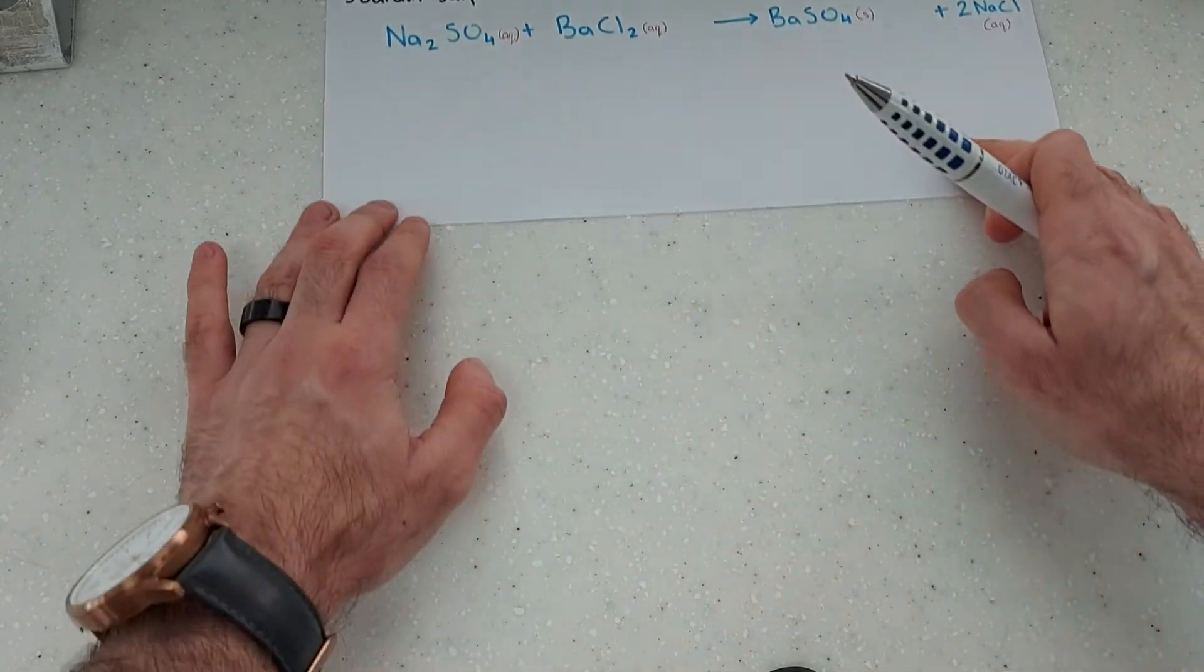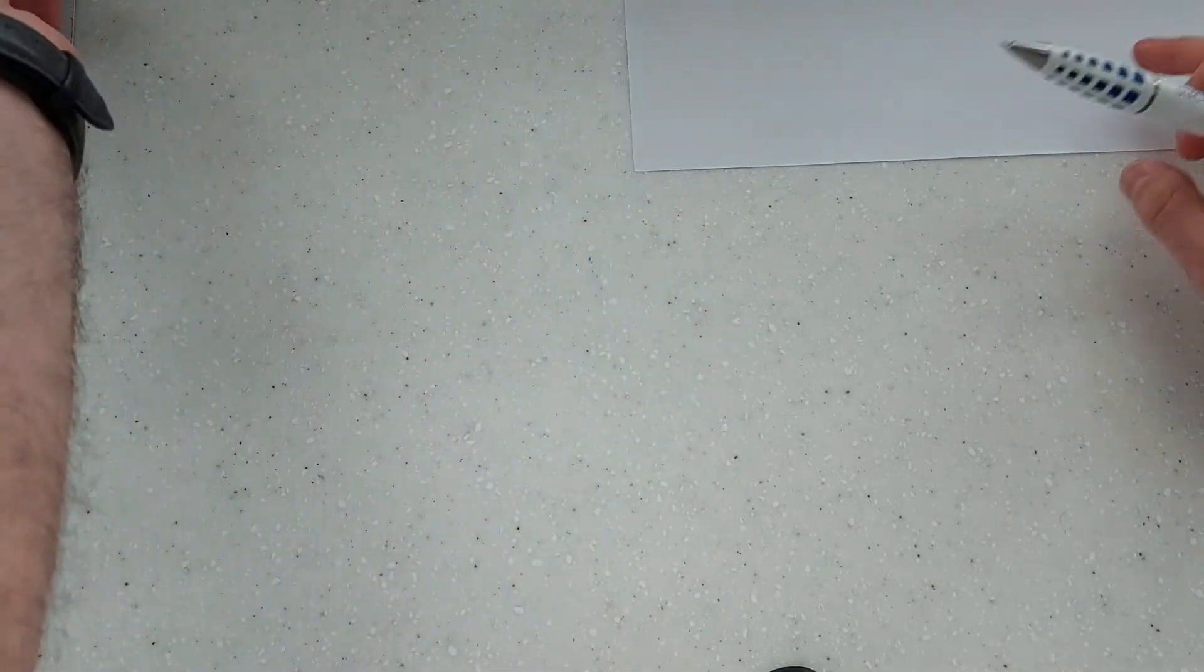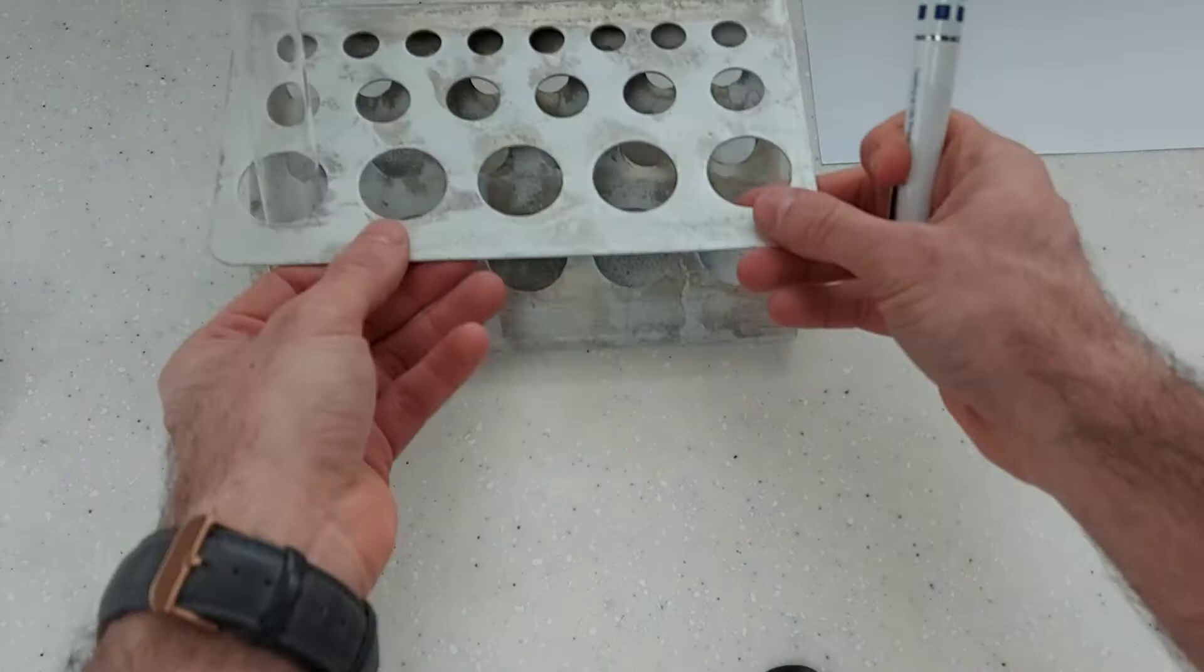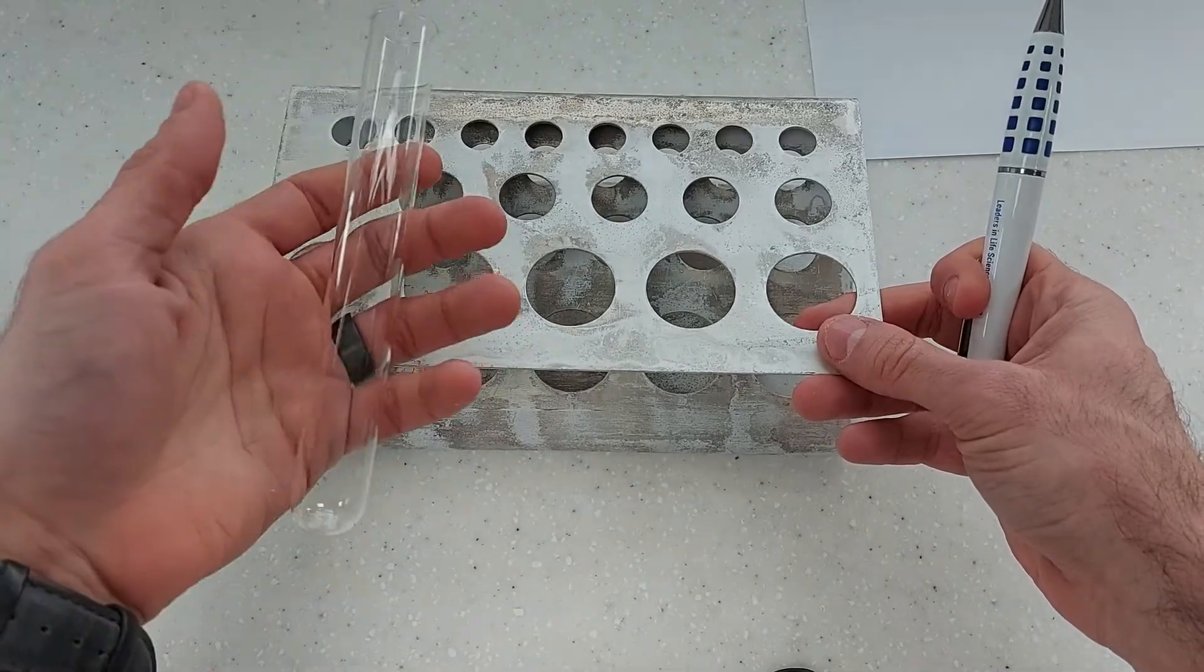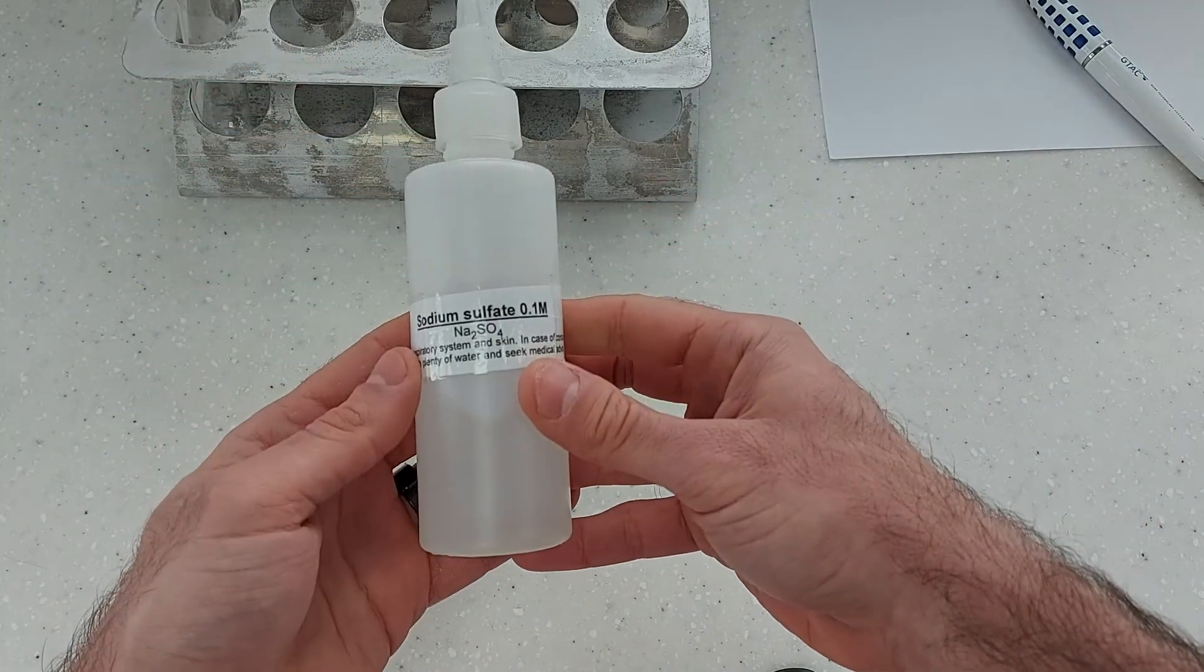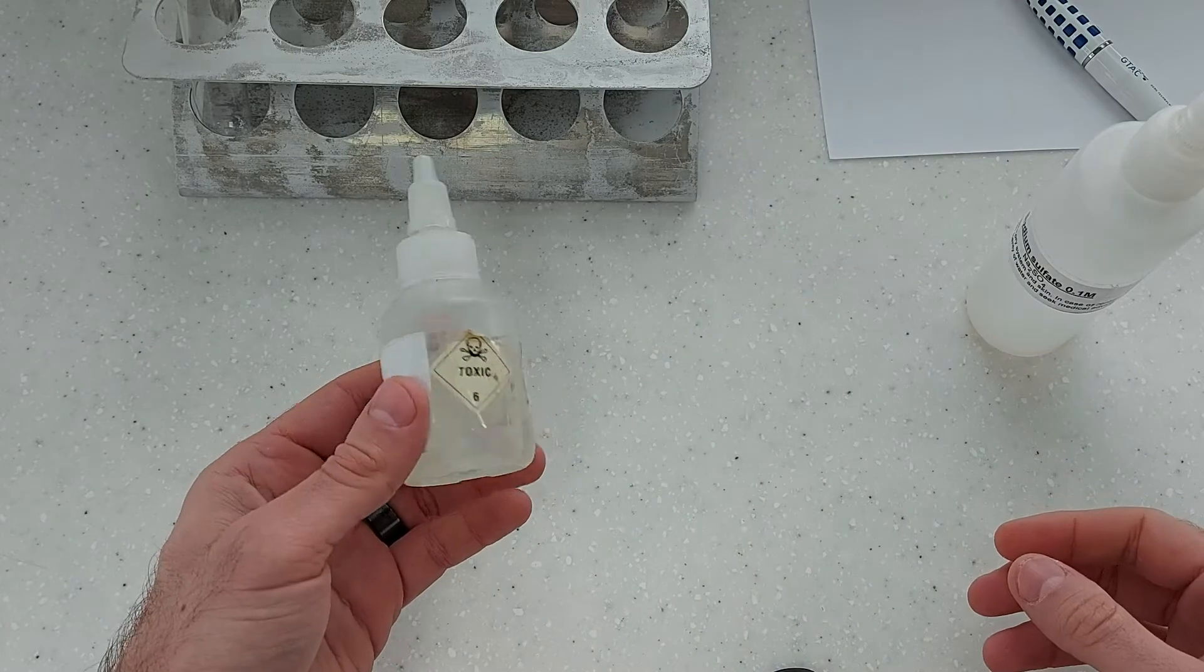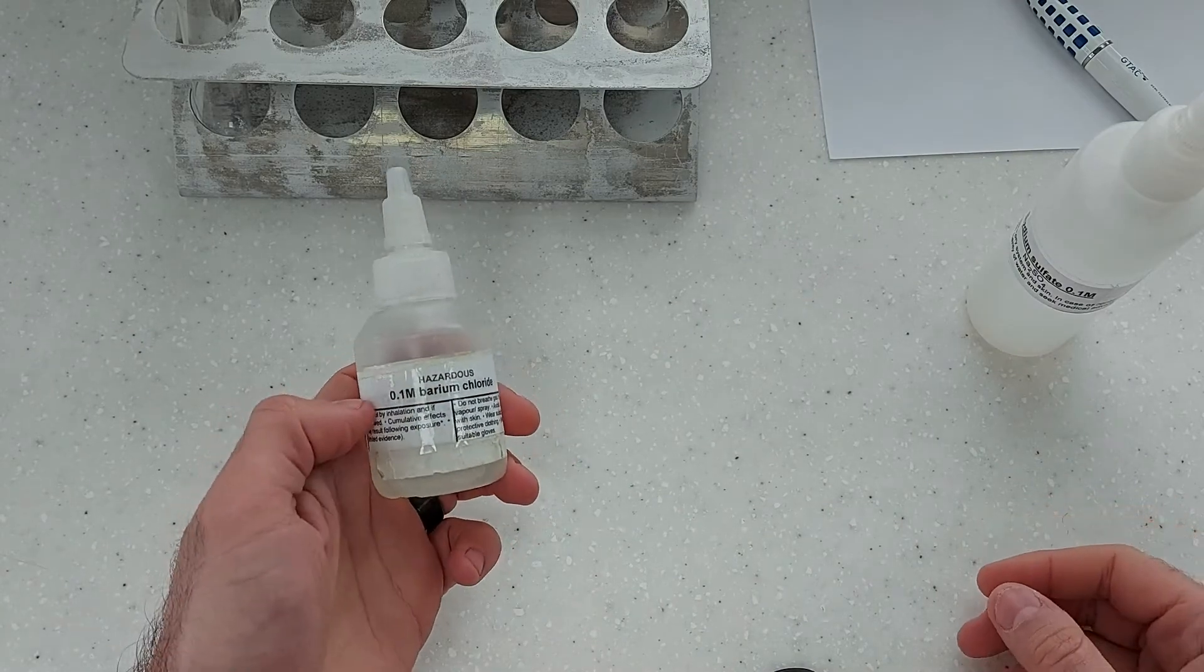Okay let's put this just there for the moment and then I'll bring in my materials. So here I've got a test tube rack and a test tube. I've also got my sodium sulfate and I've got my barium chloride here.